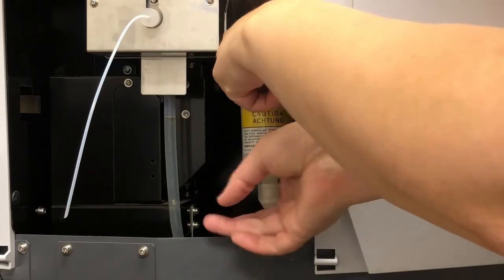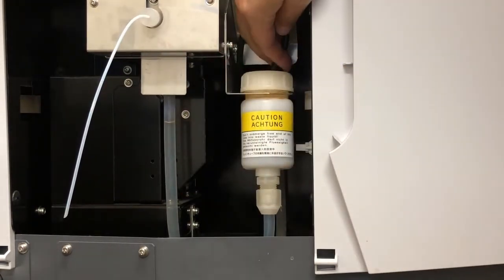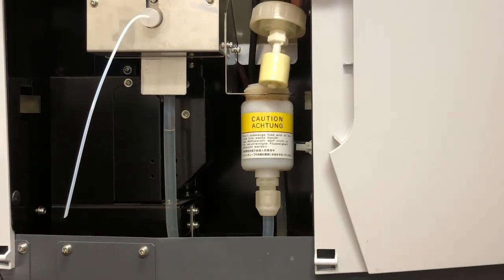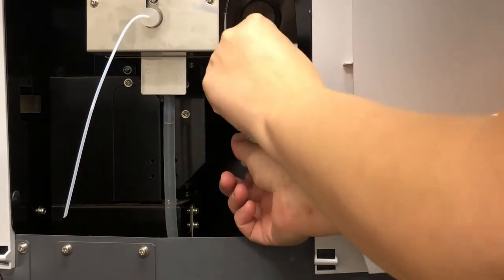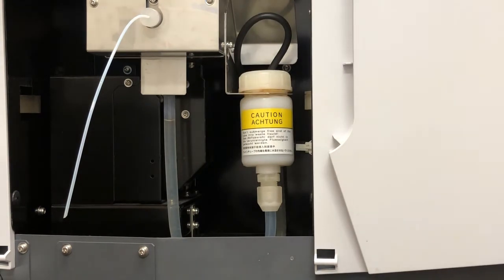So if I take off that cover, you'll see that inside there is the drain sensor. So it wants to make sure that that is working properly. So it wants us to lift it over the surface of the water and hit OK. And then we put it back under the surface of the water, screw it back on, and then it'll ask us to check that the drain sensor is below the surface of the water, and we hit OK in the machine as well. So there's a couple different things we have to manually do there.